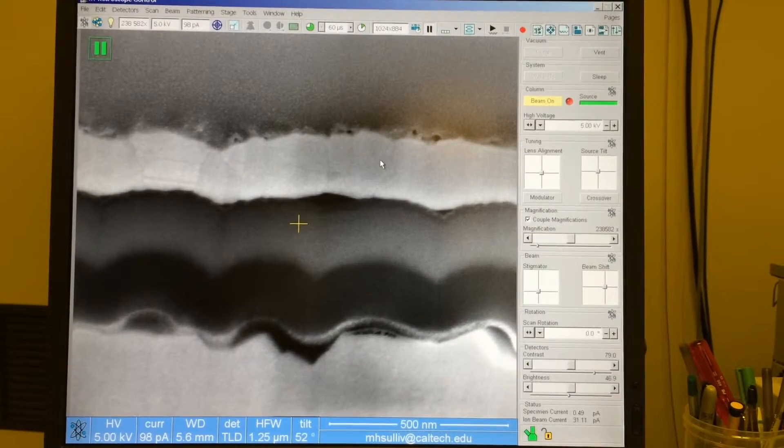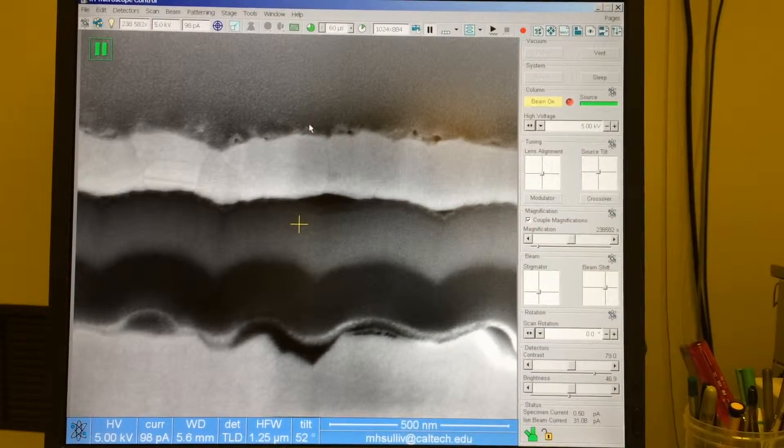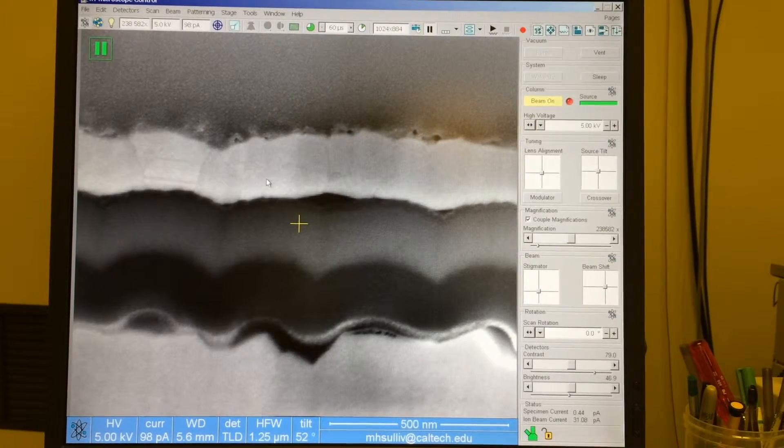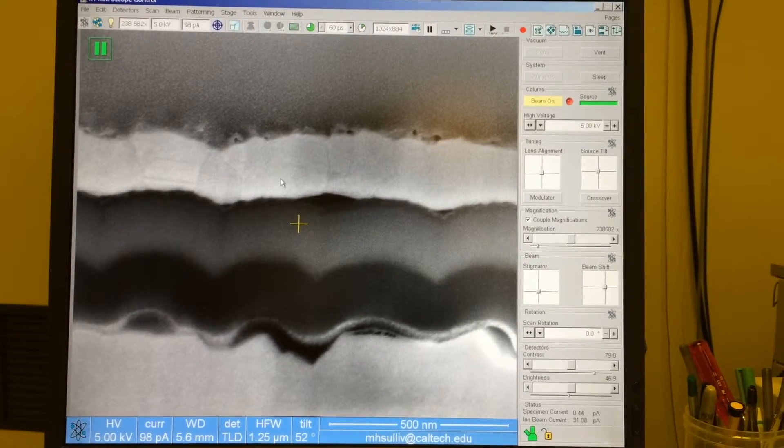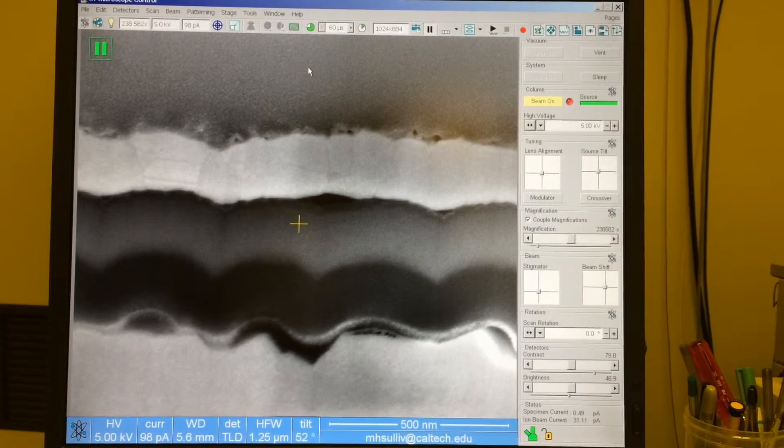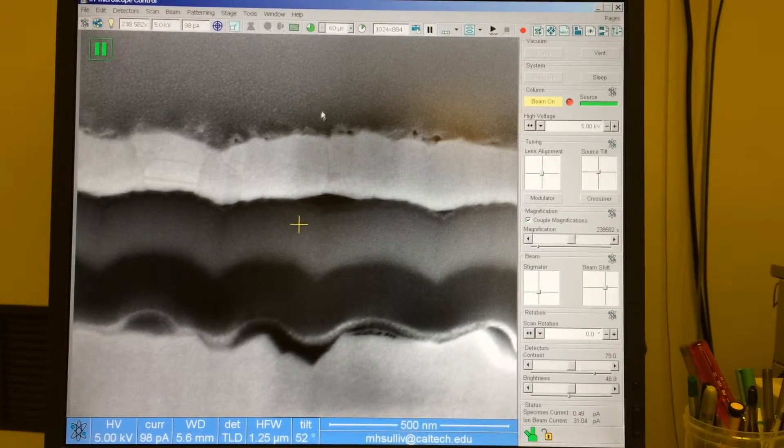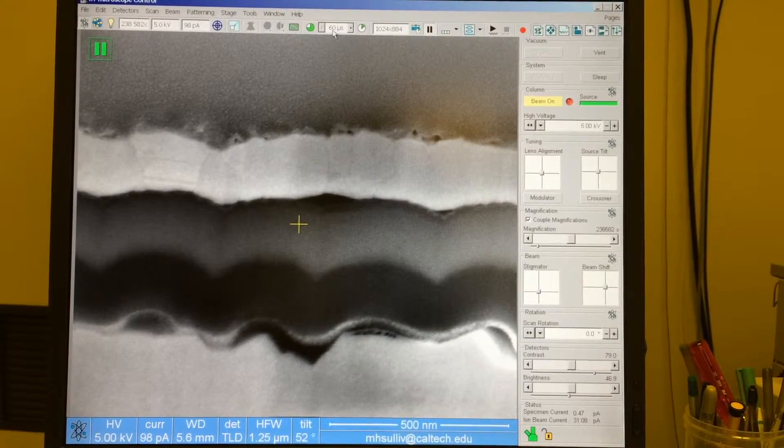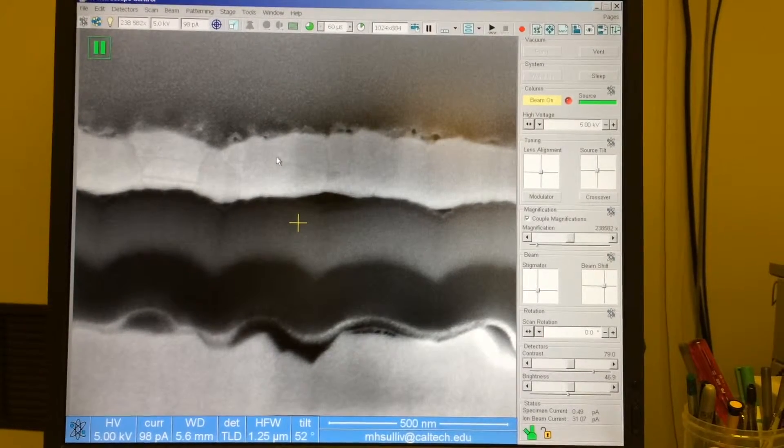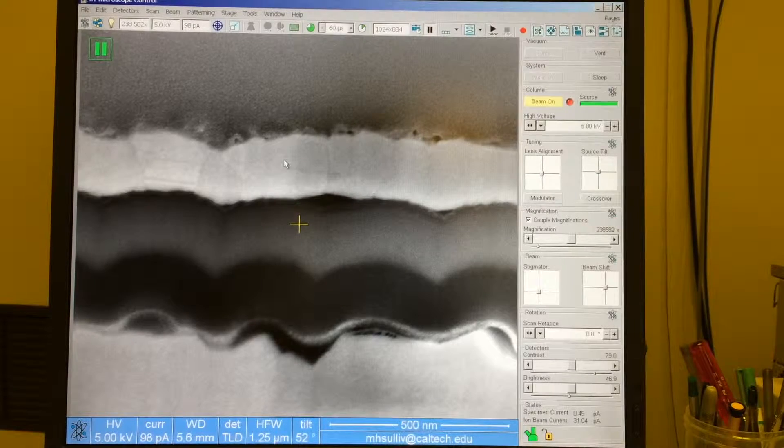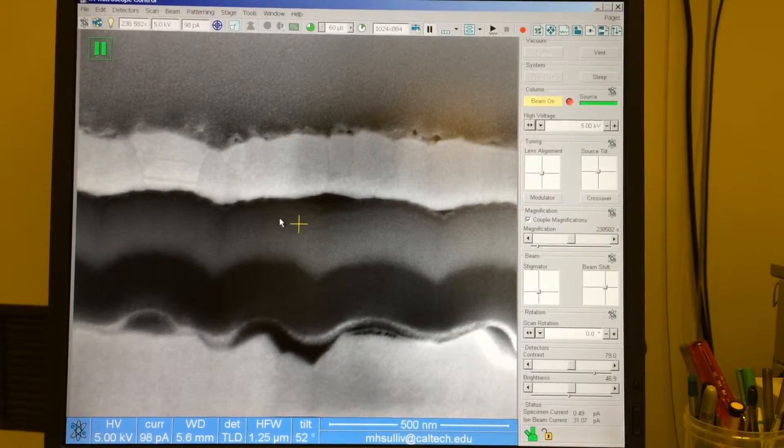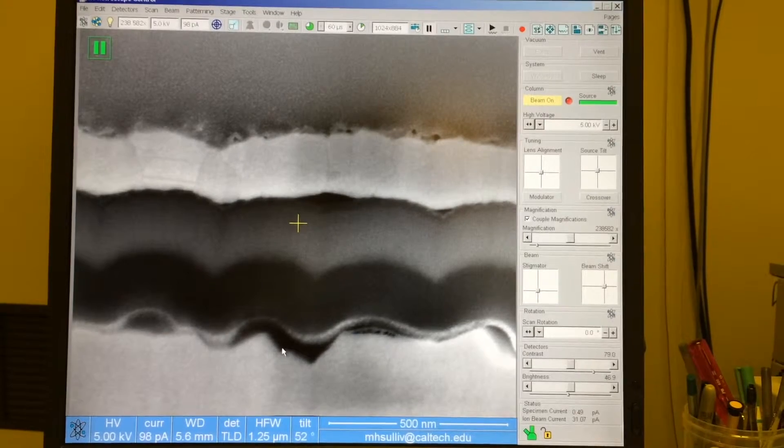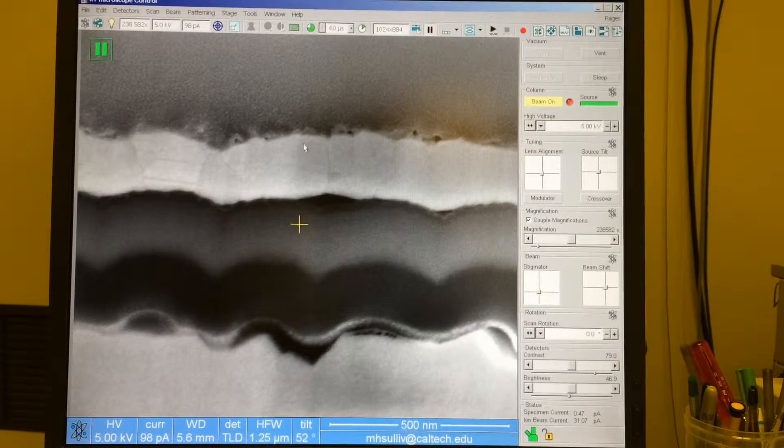Another thing we want to be aware of is at long dwell time, are we doing anything to stretch or shrink the thickness of our layers? So what can happen is if you have any beam drifting while you take the image at long dwell time, you can essentially get the image to drift with the beam scan, which would elongate the layer, or if it's drifting counter to the beam scan, it would shrink the layer. So here I want to save this image.